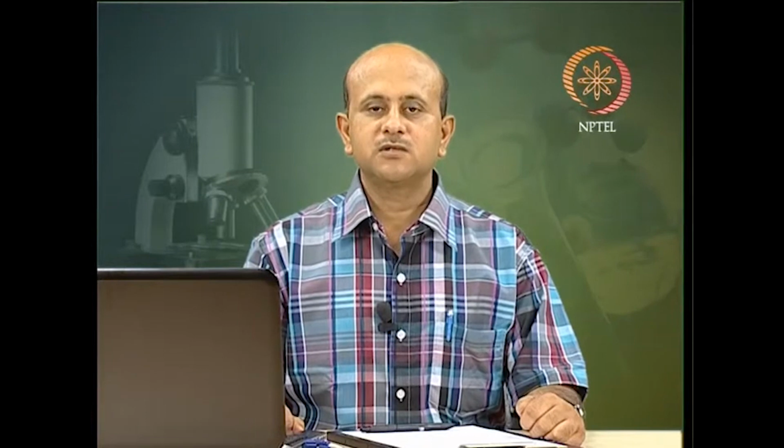Then we have discussed different types of centrifuges, and if you could recall, in the last lecture we discussed from the very small benchtop centrifuge to the high capacity refrigerated centrifuge, the high speed refrigerated centrifuge, and the analytical ultracentrifuges. Also, we have discussed the analytical ultracentrifuges in detail.